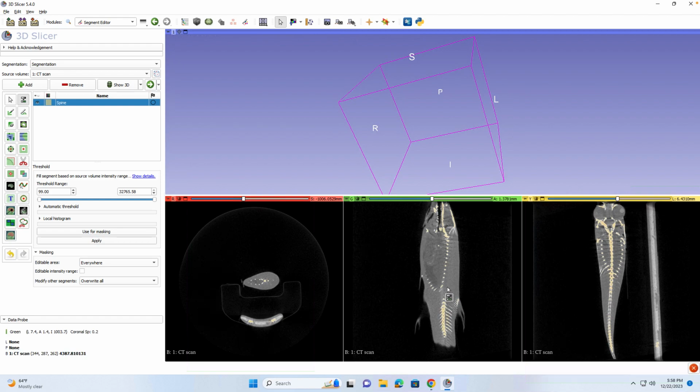So this is just taking different intensities from the tissue around the spine or those organs, and it's comparing it with the intensity of the spine, and it's making a contrasting color to it. So here you can kind of see that yellow color, right? So it's picking up the spine as this high intensity figure or feature that we want. So we can look at that.